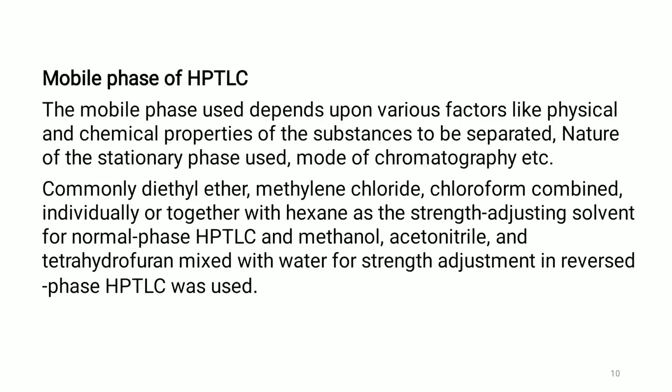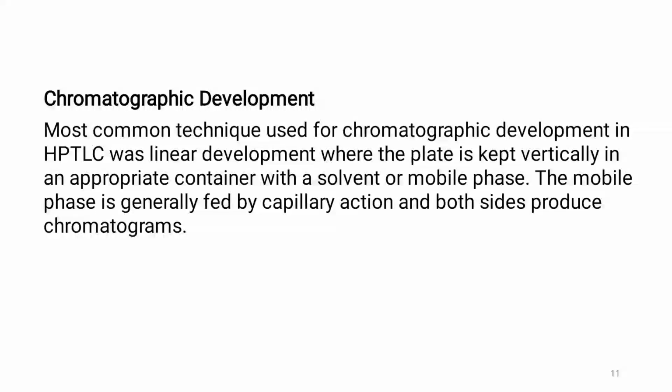Depending upon the requirement of experiments, the above solvents are used in different ratios to prepare the mobile phase, which is helpful in separation.